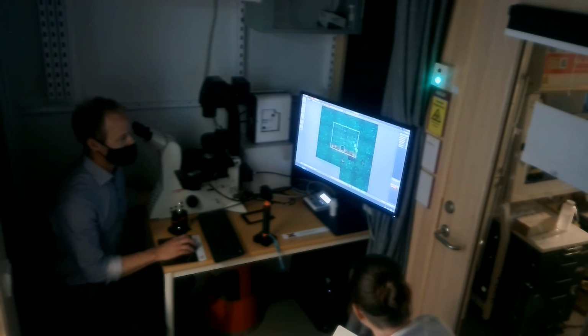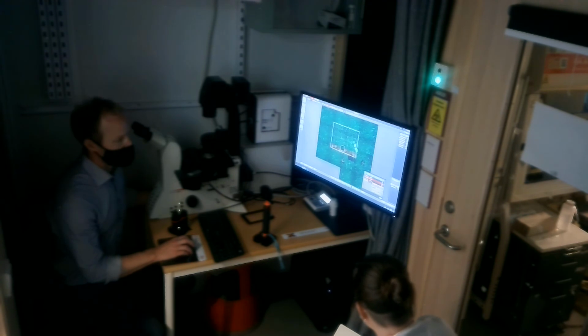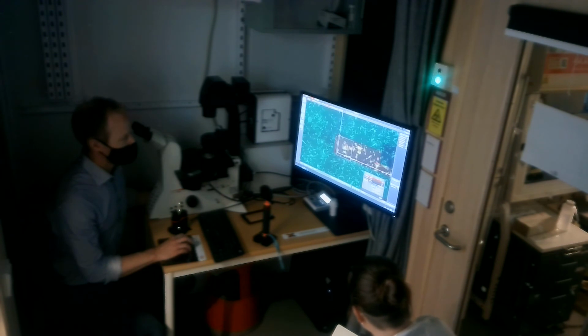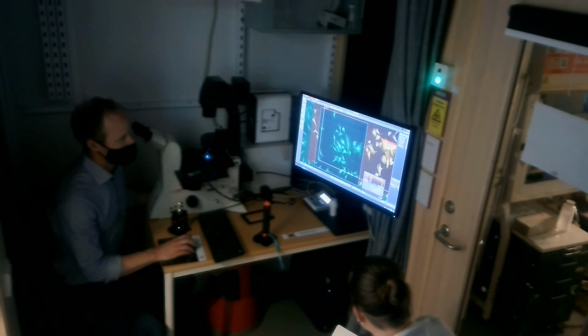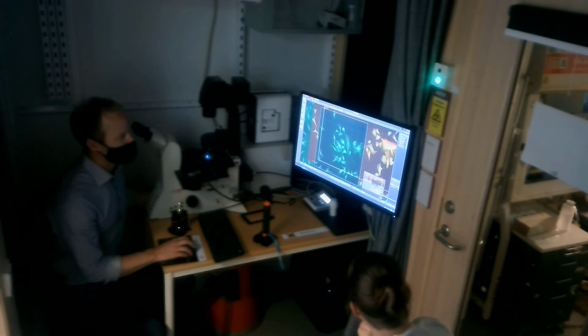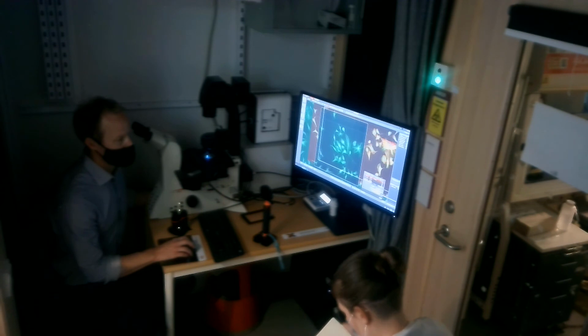You also have the possibility, if you set up several of these, if I open up this tool again, where we have our points here, I'm just gonna clear all the set, like we haven't done anything. I can go to the first one, and I typically would just check so that I am more or less in focus on that one, and perhaps set that one by hand. But then you can find the remaining by autofocus. So doing that, it would be going around and setting the rest using autofocus.